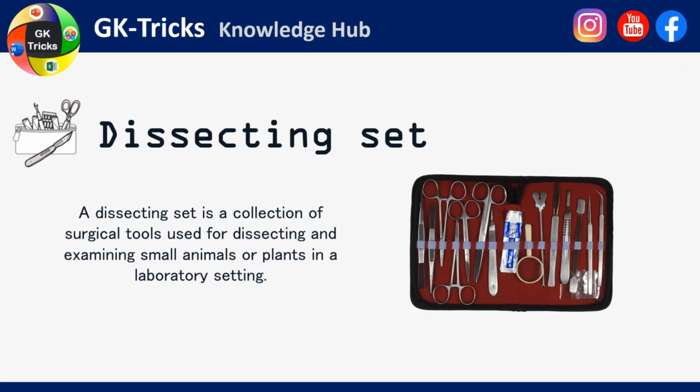Dissecting set. A dissecting set is a collection of surgical tools used for dissecting and examining small animals or plants in a laboratory setting.